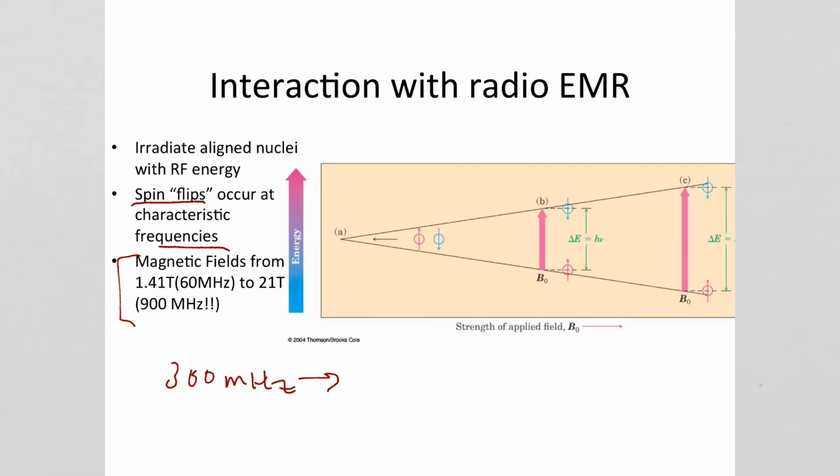Our NMR is a 90 megahertz NMR, and it's what's called a permanent magnet, meaning it's going to have its magnetic field. It may vary a little bit with temperature, but it's going to have a magnetic field no matter what temperature it's at. So it can hang out at room temperature and doesn't require liquid nitrogen and liquid helium to keep it magnetic. So that's very easy for us to maintain here at Guilford College.